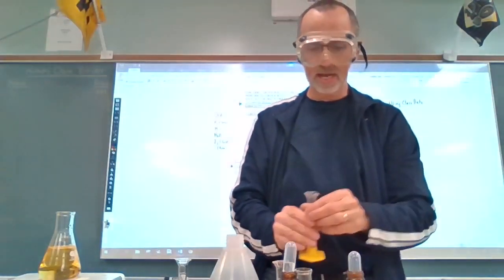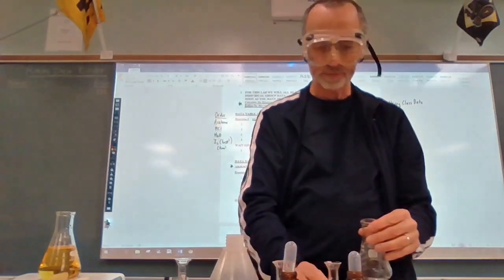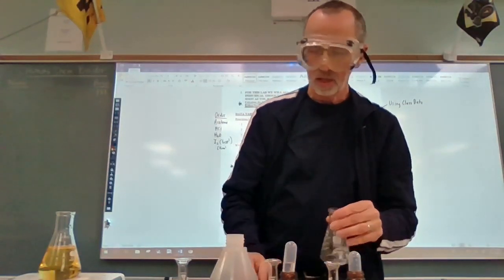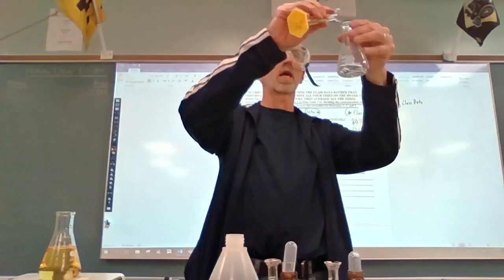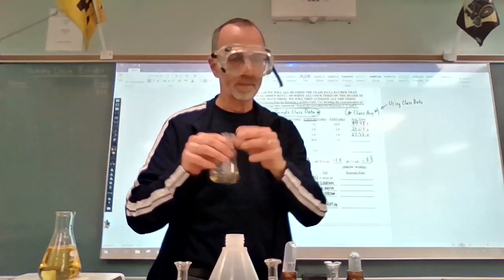Okay, so I'll add these two. Again, no water on this one. Get the phone reset here. Okay. And here we go.